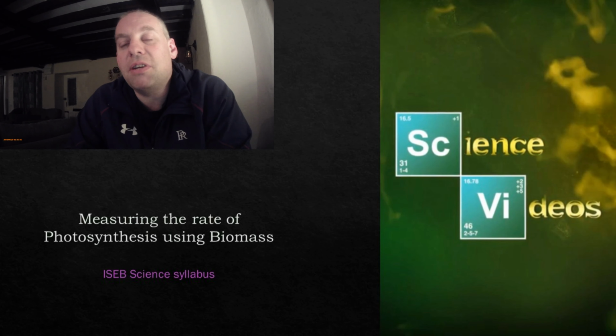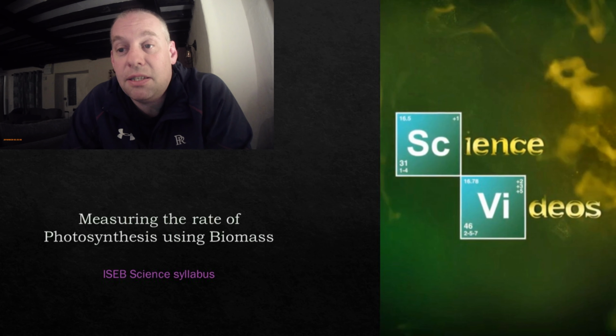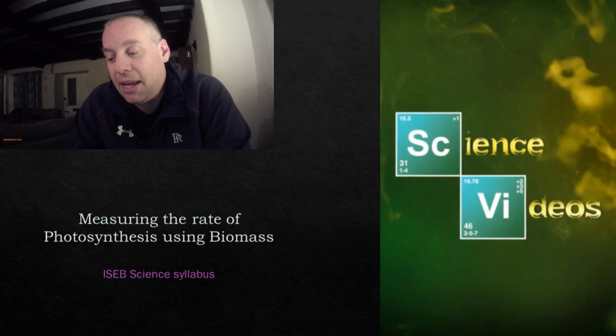Hello and welcome to another edition of James and Chris Science Videos, where today we're going to be looking at measuring the rate of photosynthesis using biomass as our indicator.